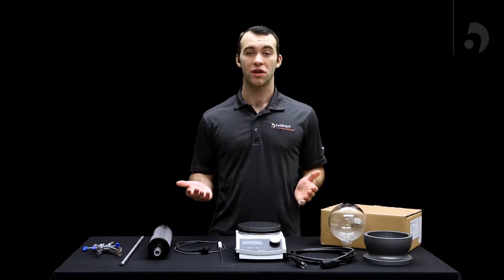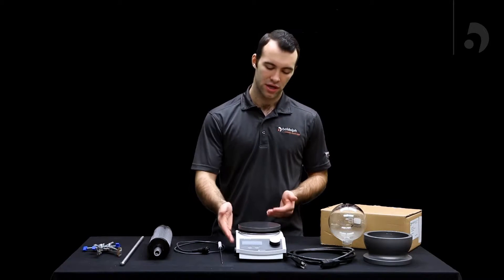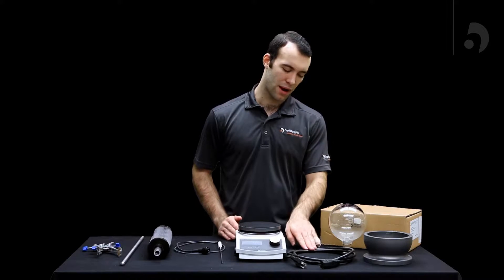Hi, I'm Nate from HiDolph and today we're going to be assembling the HiConnect. The things that come in the HiConnect box include the hot plate itself and the power cord.